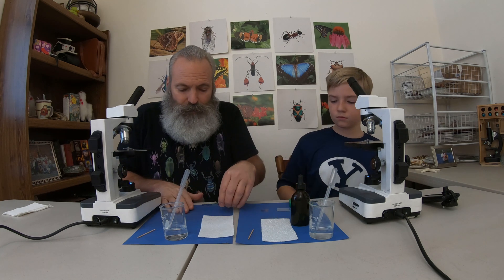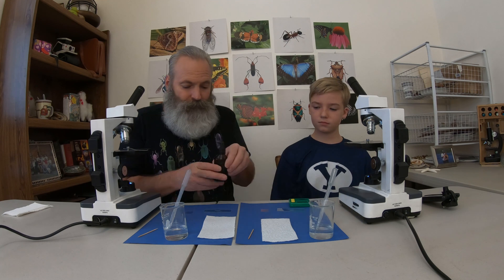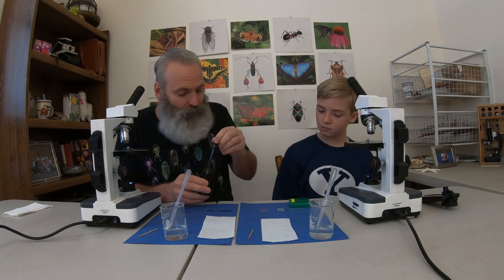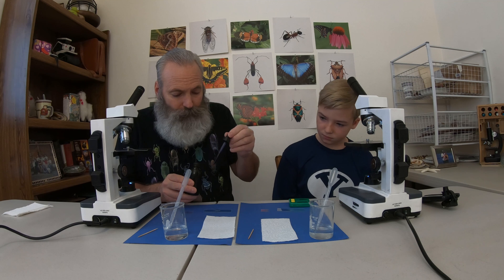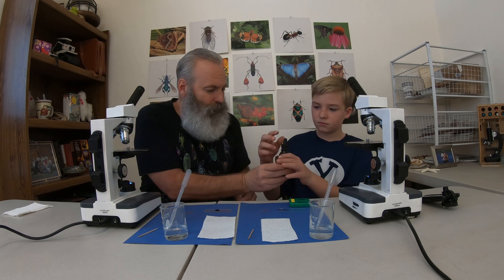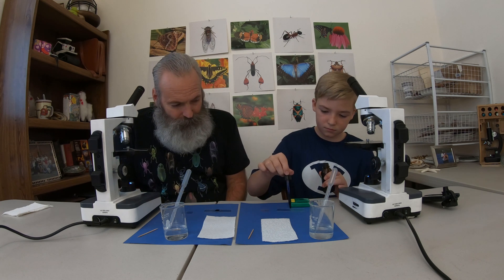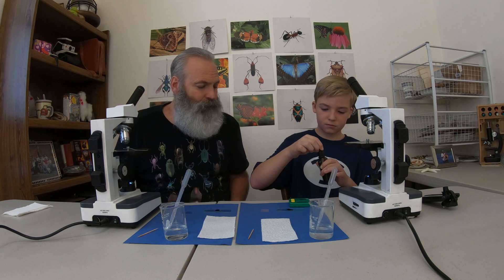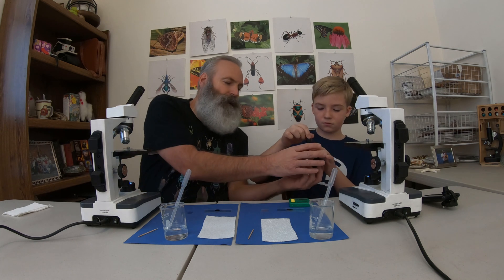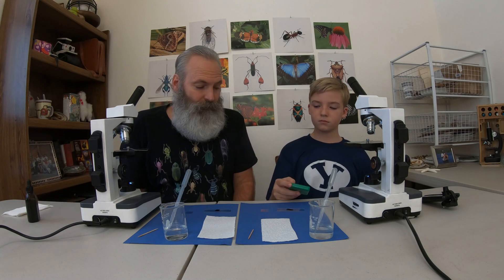Since they're small and transparent, we're going to have to add a stain so that you can see them. I'm going to have you take one drop of methylene blue — we just want one drop. I'll put that drop right there. And then we're going to time it for 60 seconds. Jake, you're in charge of the timer. If we went two minutes or something like that, it would be a problem — it would be too dark and we wouldn't see the nuclei.